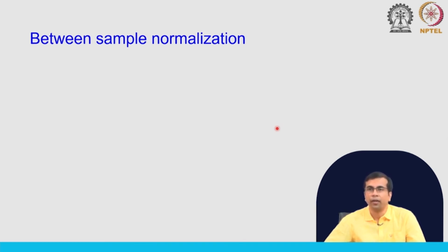One of the major applications of RNA-seq is differential gene expression analysis. We will talk about this in subsequent classes, where we look into the expression levels of the same gene across different conditions, across different samples. This means we have multiple samples within a data set and we are comparing expression levels of genes across these samples. To do that effectively, we need between-sample normalization. So, we need to address some of the issues that we have just mentioned, such as RNA composition bias.